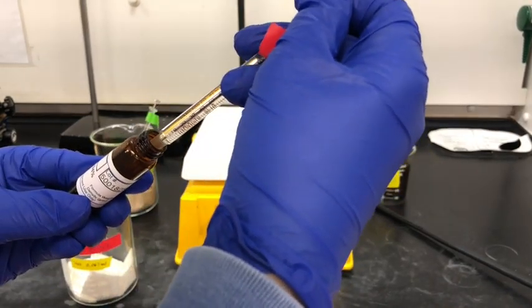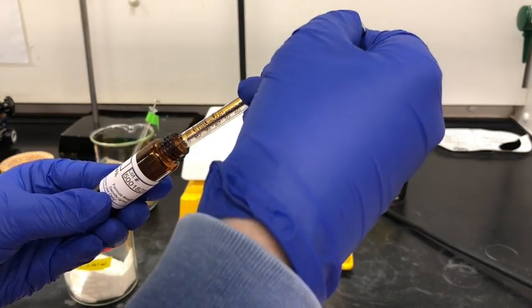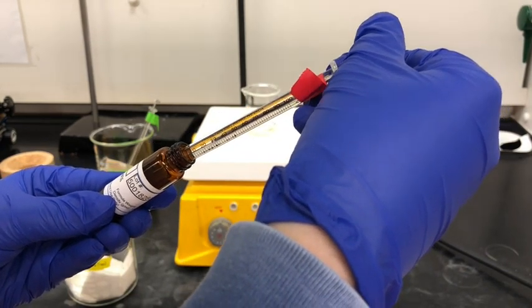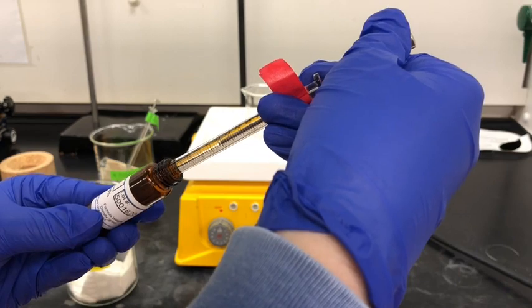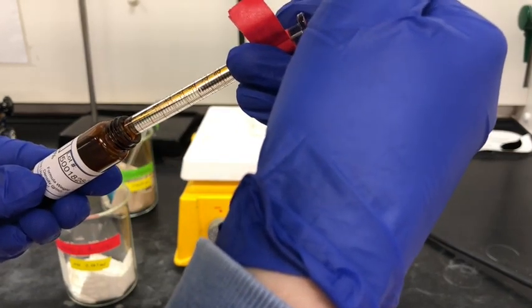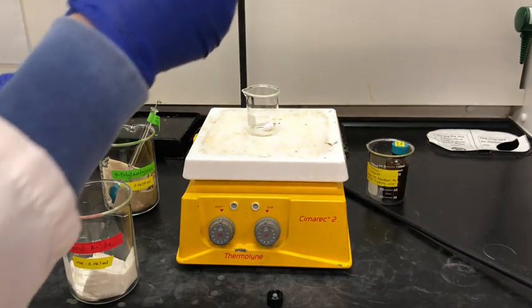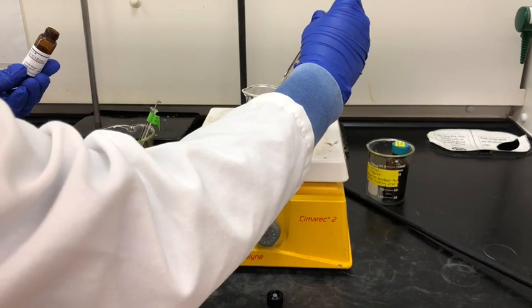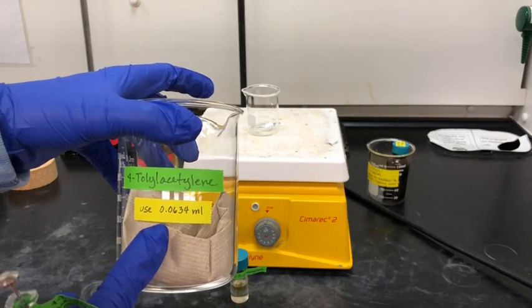I'm going to draw up the benzyl azide solution very slowly to prevent any bubbles from forming, which will give us a false volume, and I'm going to try to be as accurate as possible. I'm going to try to get right on that 67 microliter line, and then once I'm content with my measurement, I'm just going to add it to my beaker with the stir bar.